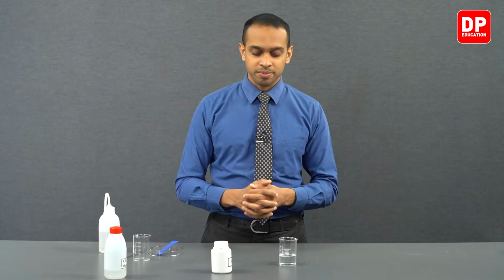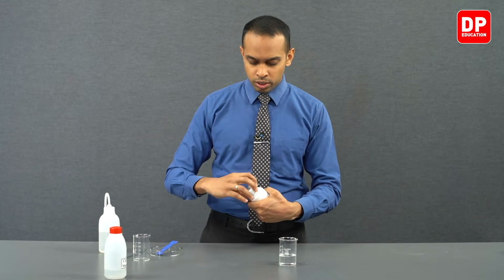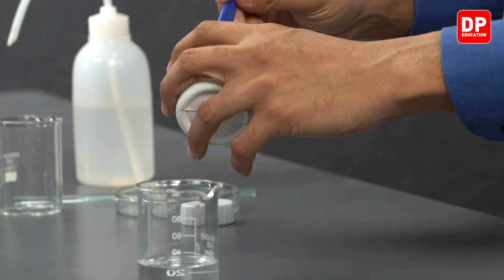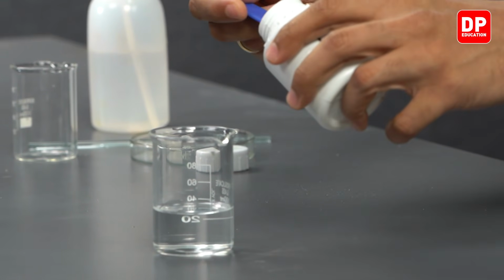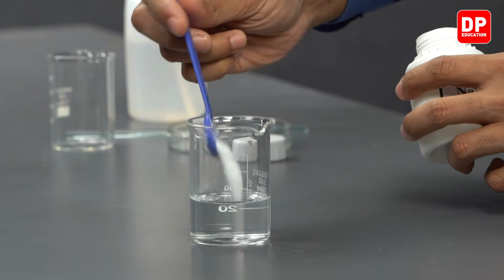You can see sodium sulfate clumps together, and this is a clear indication that sodium sulfate has come into contact with water. Then we will move on to doing the same with methanol, and we will observe whether the methanol sample we have here has any water in it. So let's first take the sodium sulfate bottle we have here, and we will add a small amount of sodium sulfate, a white colored solid, into water.